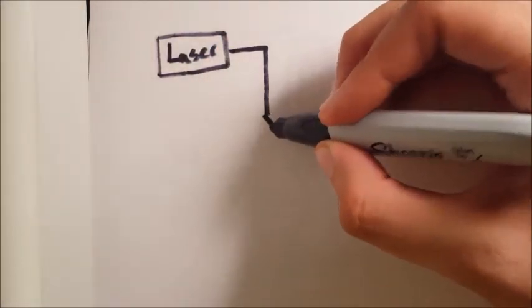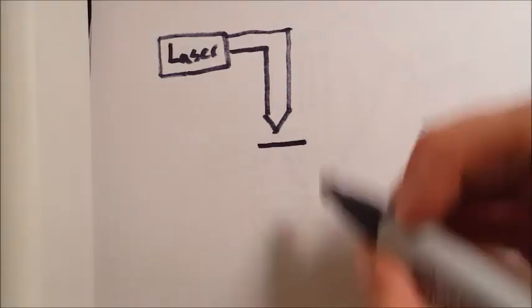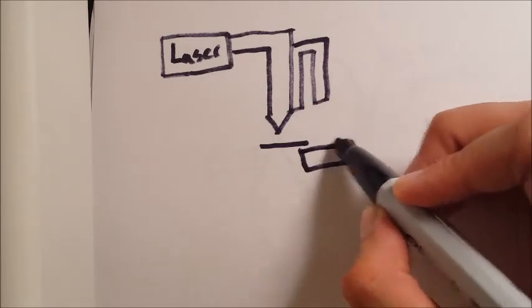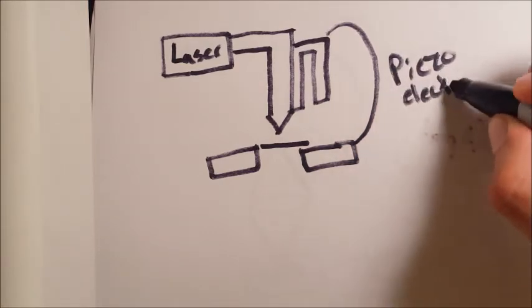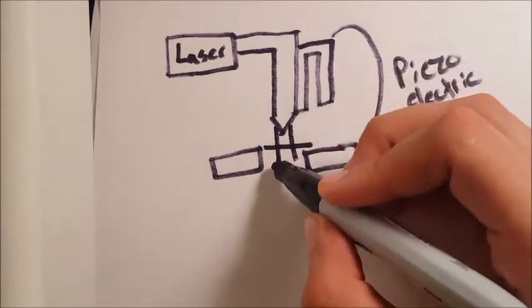Moving on to general instrumentation, you typically use a laser as your excitation light. You have your probe made out of a fiber optic with a small aperture. You place your sample very, very close to the tip with a tuning fork, which tells you the frequency as your tip moves further and closer. You then pair that tuning fork with a piezo stage in order to have very precise movement of your probe.